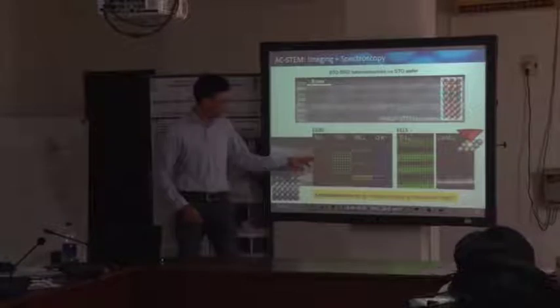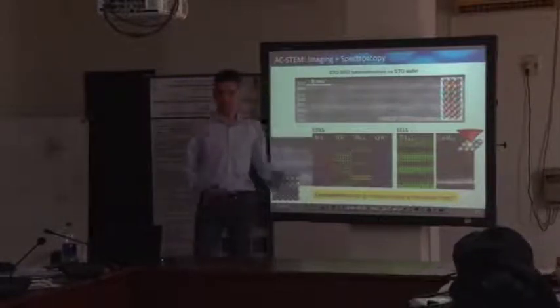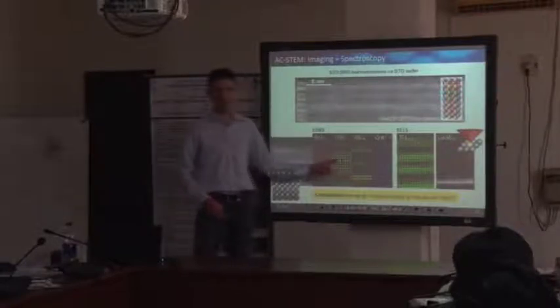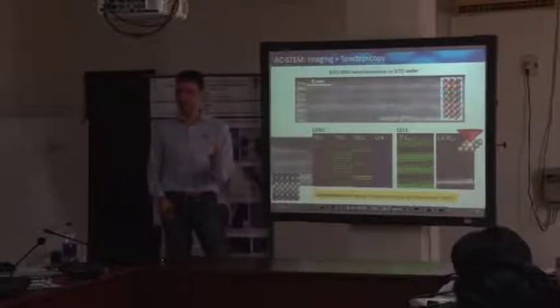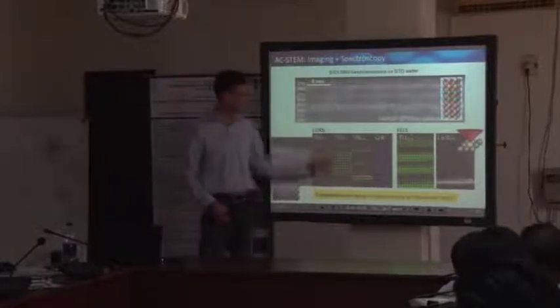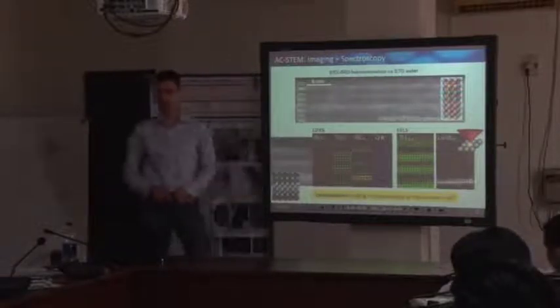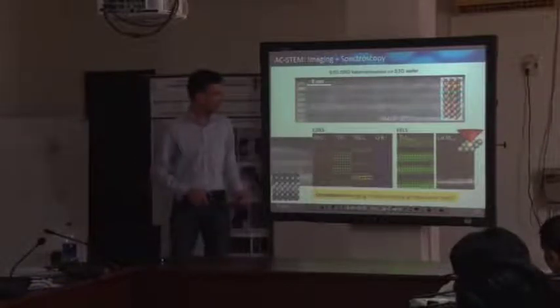You can imagine just looking at these distributions, the local intensity for each measuring point is only a few 10 element-specific counts that you can use. So it's not like 1,000 counts per X-ray line that you may use.